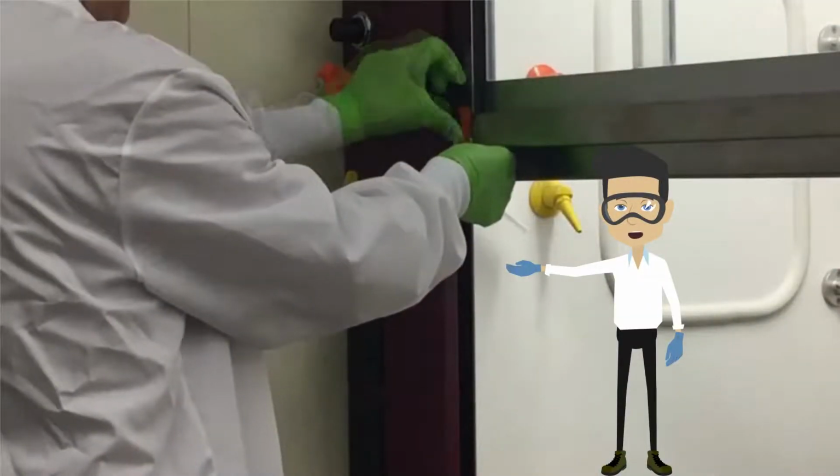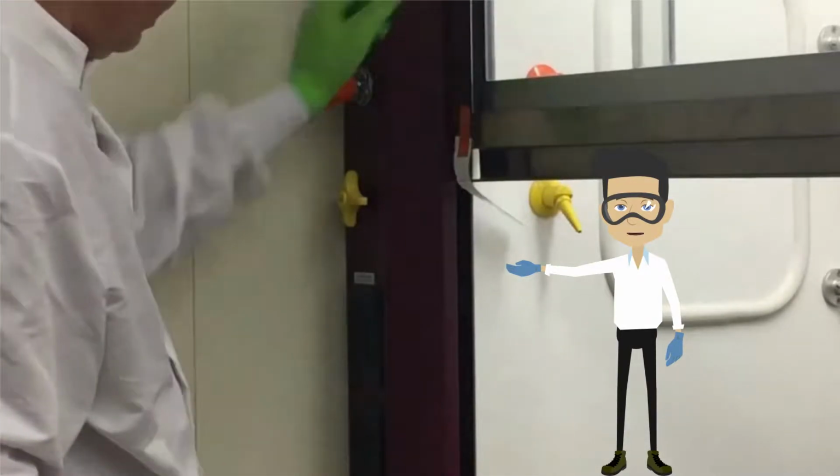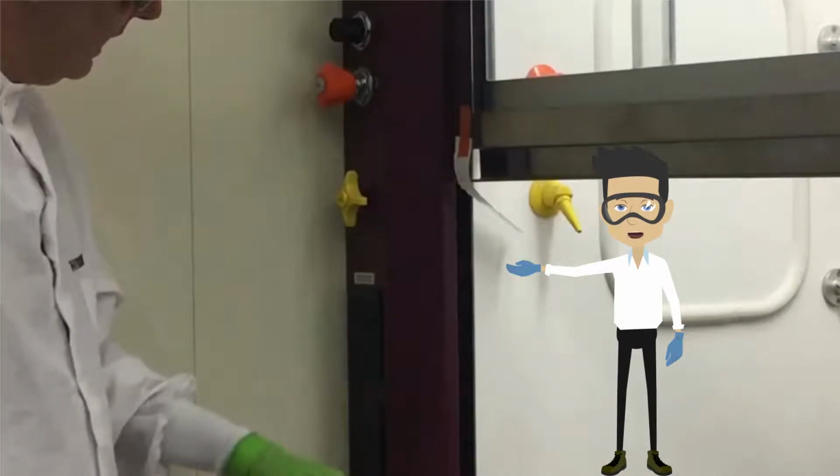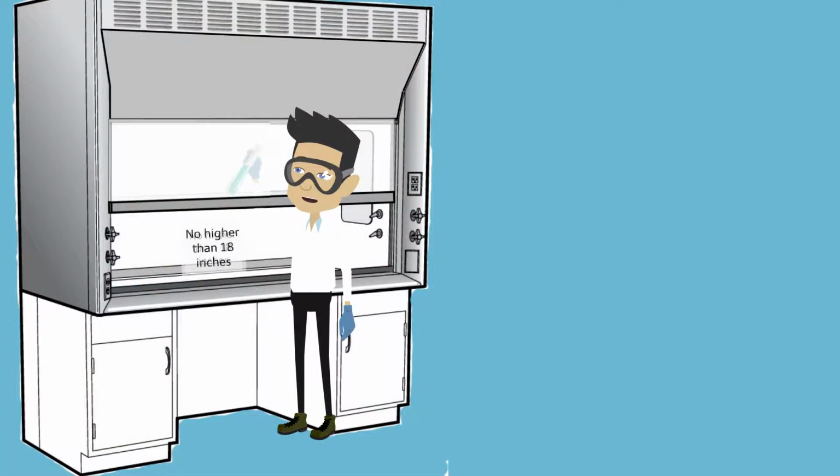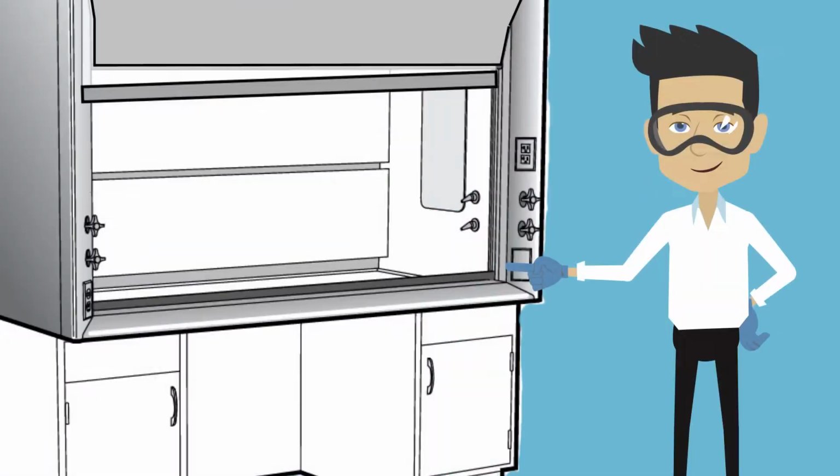If your hood doesn't have a monitor, verify airflow by taping a piece of tissue to the sash, like I'm doing here. As you see, the hood is working as it should and drawing the tissue in through the sash opening. The lower the sash, the more draw. The higher it is raised, the less it draws. Work with the fume hood sash in the lowest possible position, no higher than 18 inches, so it can act as a physical barrier if an accident occurs in the hood.